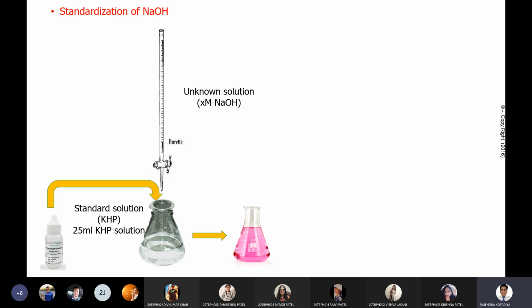So specifically phenolphthalein in acidic condition as well as in neutral solution, it won't give any color, but in alkaline solution it changes to pink color, જેવું આપણને અહીંયા દેખાય છે. So color change થાય છે શું બતાવે છે આપણને? શું ઇન્ડિકેટ કરે છે?